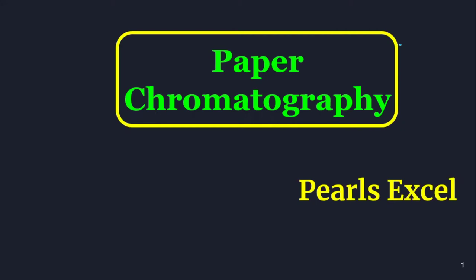So we are all aware that chromatography is a very famous separation method. It is a kind of physical method of separation where the components of a mixture are separated by using a support, due to the differential movement of the continuous distribution between the stationary and the mobile phase. So that is nothing but the chromatography method.